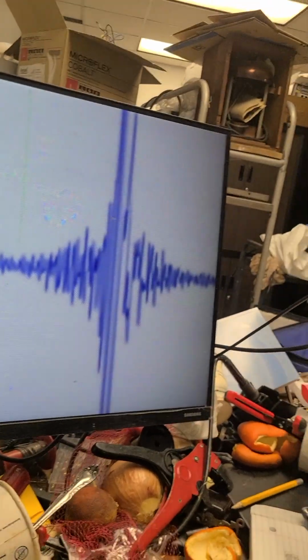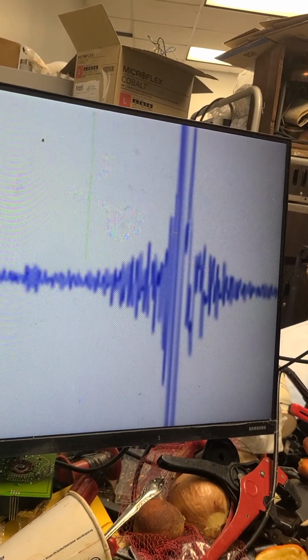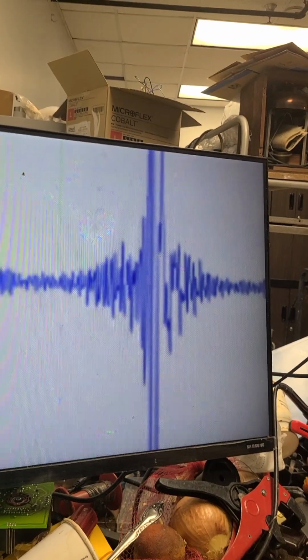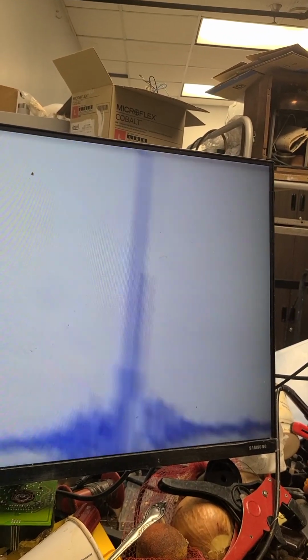Now, the reason why this is in the realm of our electronics is because as we're moving that mirror slowly, it's like going up and down, in the range of, let's say, the ability of our electronics, if this is audio, then let's say 20,000 ups and downs per second is well within the grasp of an analog to digital converter collecting this data, and then using a computer to do the Fourier transform on it to turn it into a frequency graph.